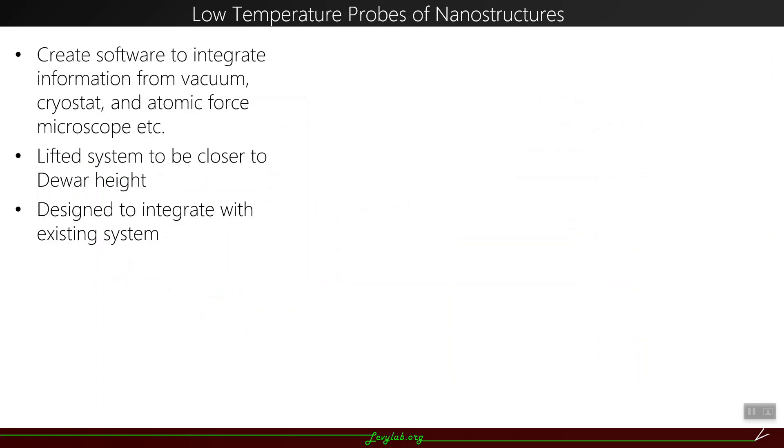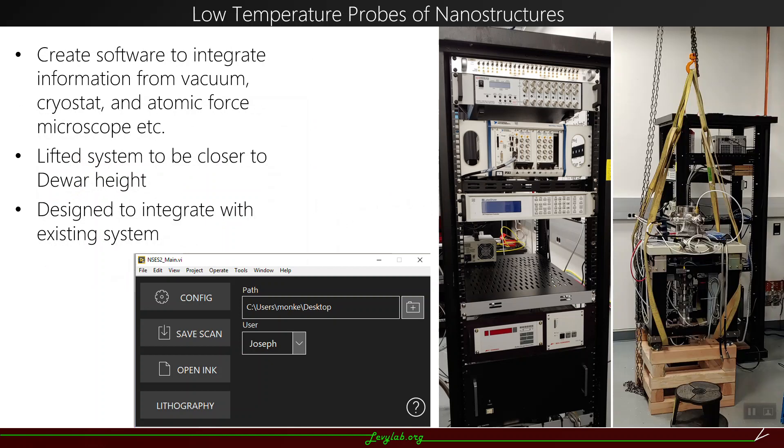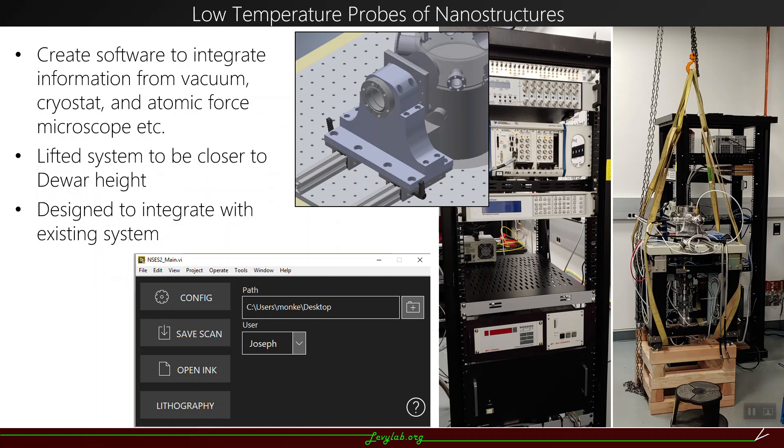I've been creating the low temperature atomic force microscope system. I needed to create software to integrate things like temperature readings, pressure readings, and results from the atomic force microscope. I had the cryostat and microscope lifted using a crane to be closer to the height of the dewars for the helium flow cryostat. I wanted to make sure that everything I designed integrated with the existing system. For example, we use rails that hold the cryostat and slide back and forth so we can integrate with the existing setup for the pulse tube.